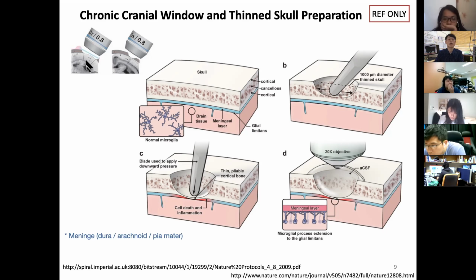For example, you have a small mouse, you block one eye, and then the corresponding visual cortex, left and right, shows spine changes you can observe over a long time. People have done this experiment to realize we can have a microscopic scale to understand neuronal level plasticity, which is exciting. Some people measured spine turnover over time, and they published in Nature.